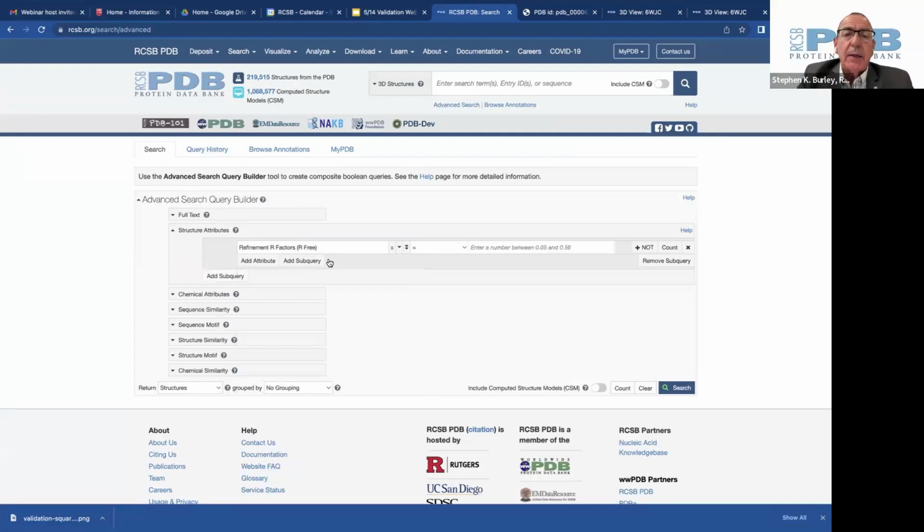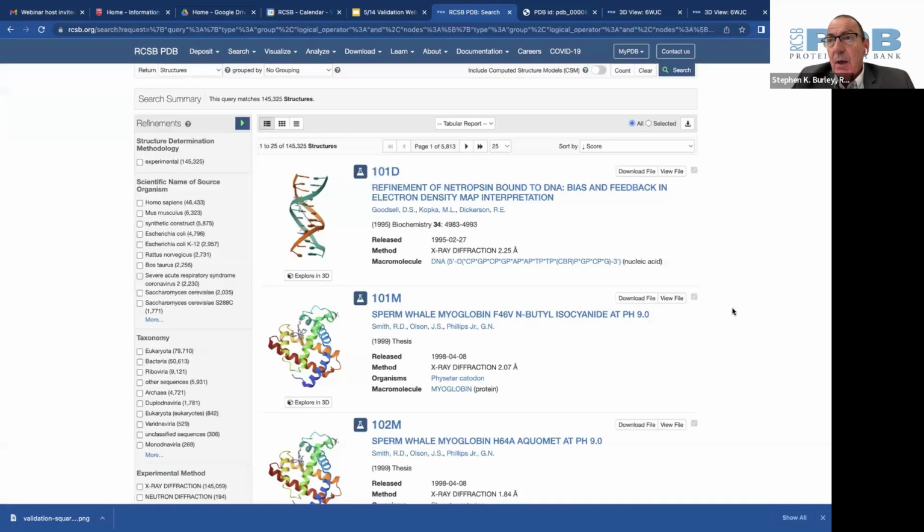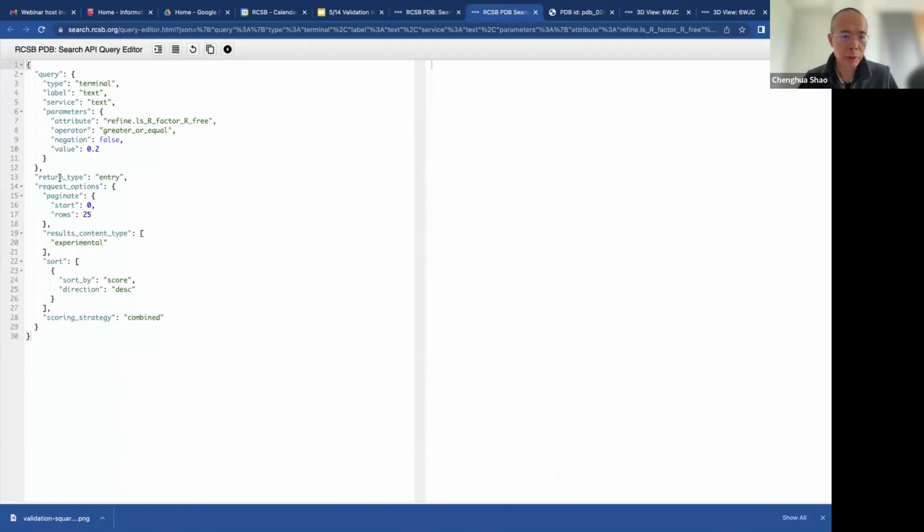So I think the answer, Cheng-Hua, is that our APIs will probably provide most, if not all, of the information that Dr. Davidson is looking for. And if you are unable to get access to all the information that you're interested in, again, please provide feedback to us. All feedback is good, particularly constructive criticism. And if there are features in terms of data harvesting, data gathering, using APIs that we're not currently supporting, we can certainly consider implementing those. Here in the example, you can search for a phrase, greater than, using the advanced search, and you can implement the programmatic search API, which you can see here. You can download this as code and run it in Python.